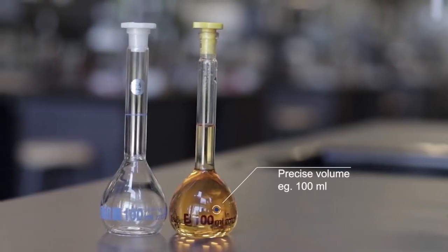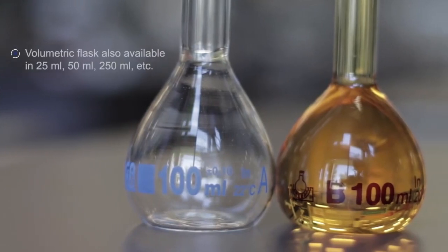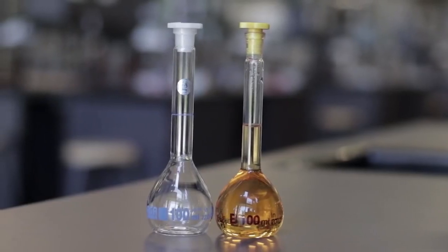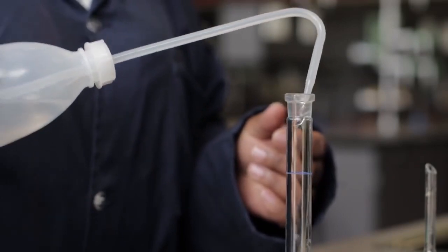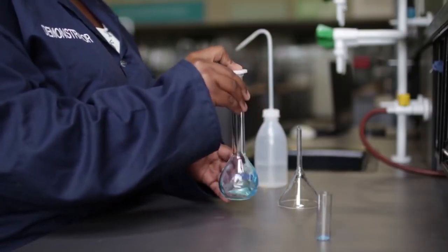Volumetric flasks contain a precise volume at a particular temperature and can be found in different volumes and sizes. Solutions are made up until the graduation line, which indicates the desired volume. The volumetric flask is used to dilute samples precisely and for the preparation of standard solutions.